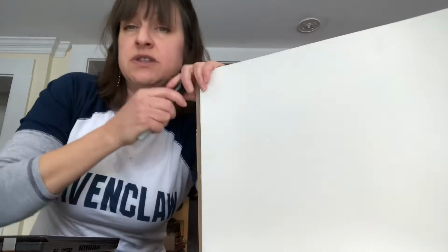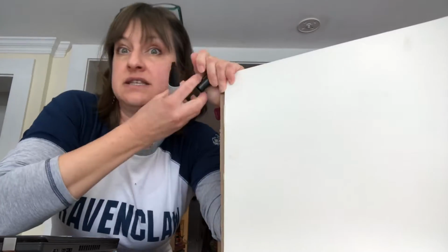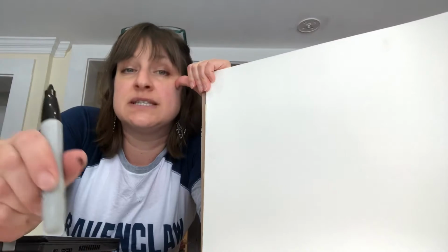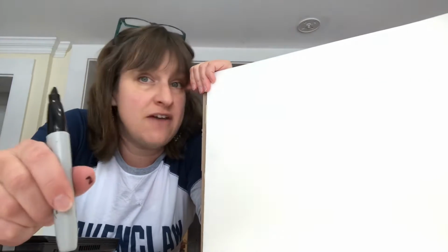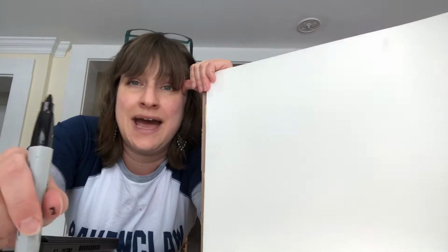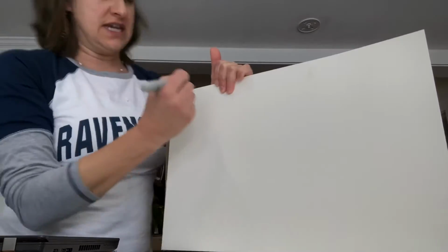All right, so let's start with a few background basics you're gonna need to know in order to get through this lab. The whole purpose of this lab is to support a claim with evidence that we will gather to show that cellular respiration has occurred. Let's back up. Okay, so we're going to use yeast for this.